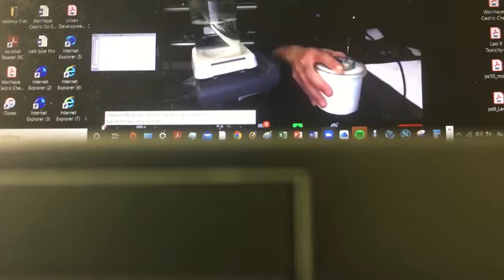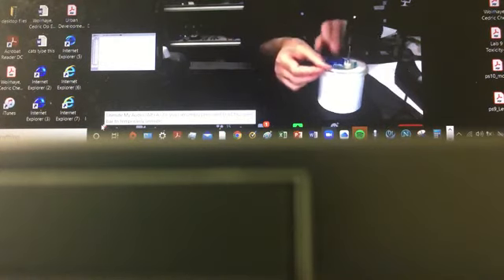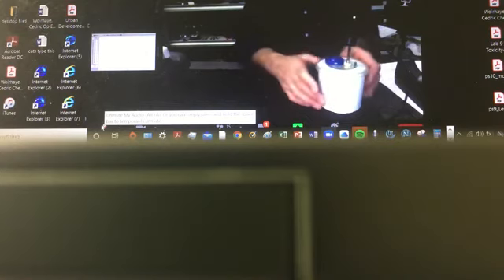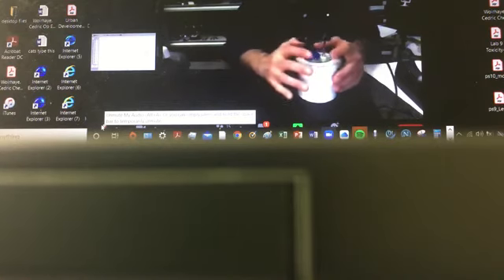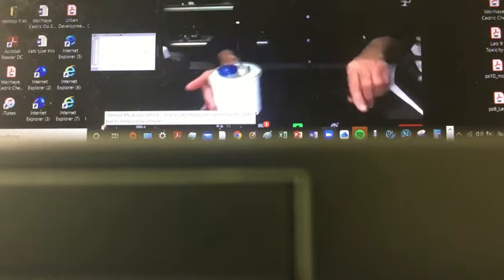So we just keep it for a while. And shut off that water. So now I'm done with that water. So as far as the calorimeter, I'm trying to tape it in such a way that the cover remains a snug fit and remains tight. So that's the calorimeter.